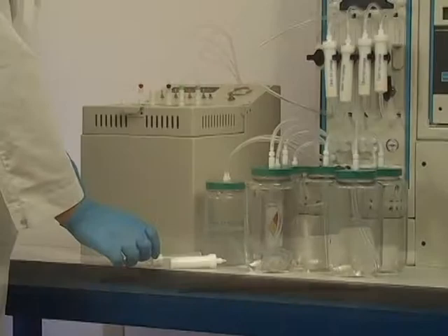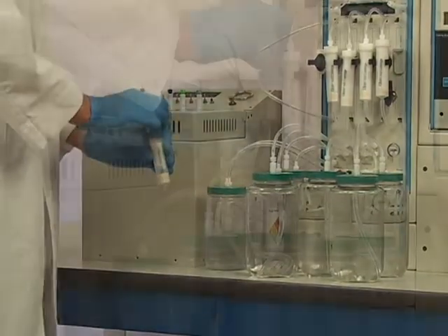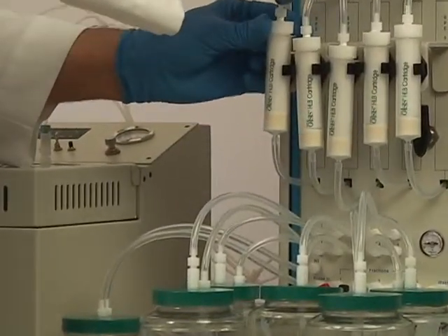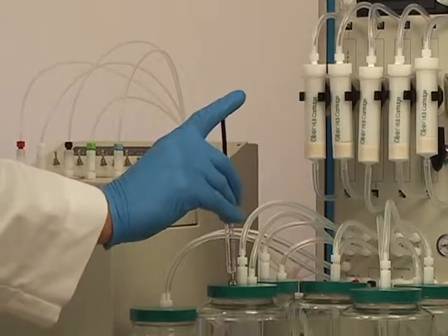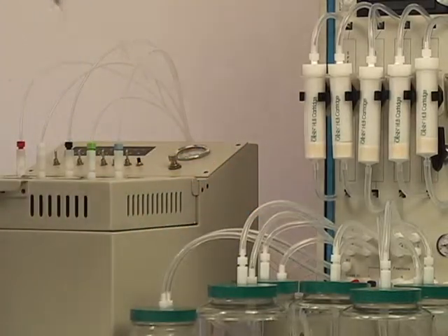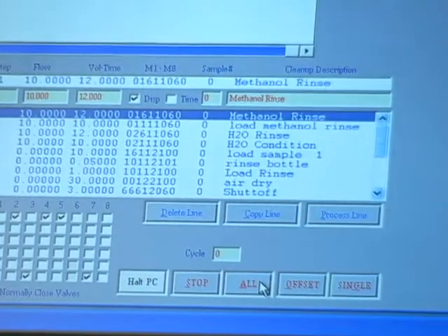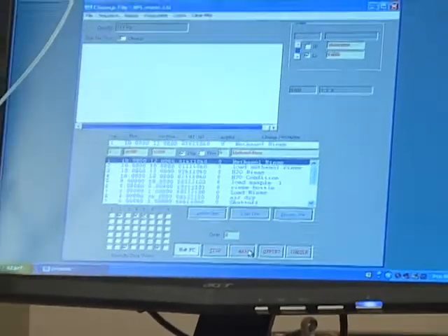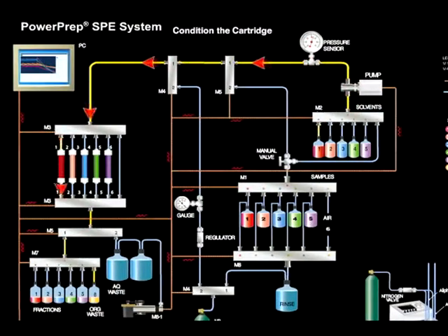An SPE cartridge or column is snapped in place with the quick-connect fittings on the unit. A sample to be tested for dioxins and PCBs in water from the field in its original collection bottle is attached to the system. The SPE program is then opened along with files for concentration, and the program is launched. The SPE system conditions the SPE cartridge with the first solvent, methanol. The solvent is then sent to the organic waste reservoir.